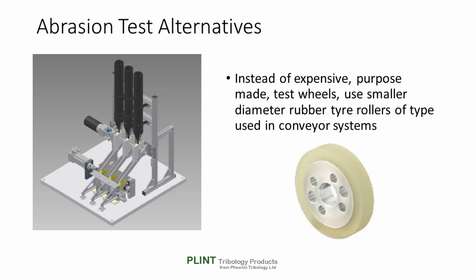One final point to note with regard to the G65 test wheels is that the sliding speed affects the bulk temperature of the rubber, which in turn affects its hardness and its subsequent interaction with the abrasive particles. To run the actual procedure, it is important to ensure that the wheel cools down between test runs. When running with reduced diameter rollers, it is sensible to run at reduced sliding velocities to minimize unwanted heating. It follows that these tests have to be run with much reduced particle flow rates, hence requiring a precision feed system.